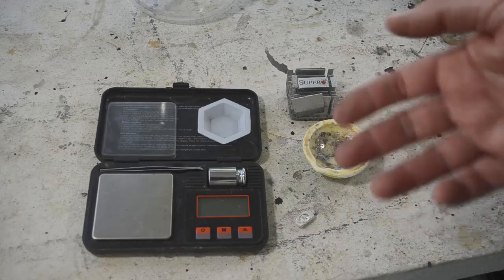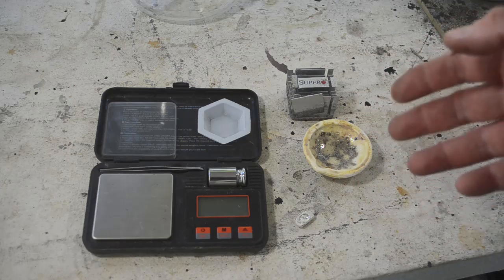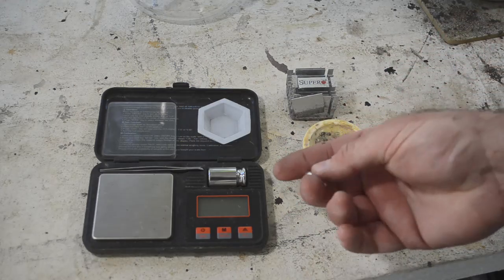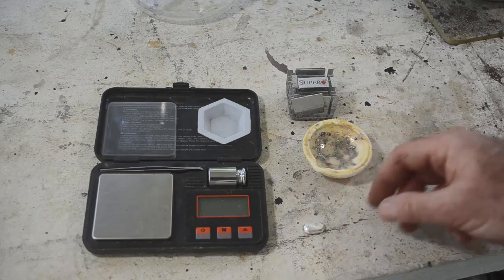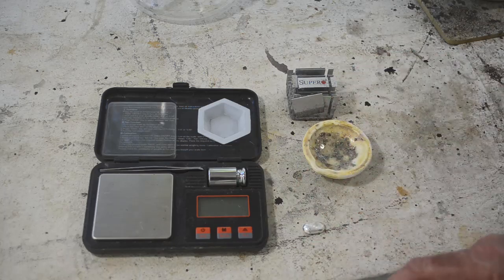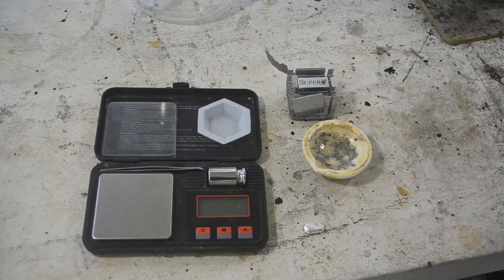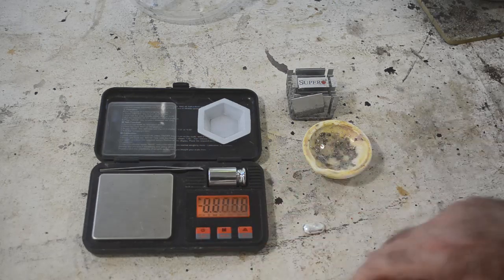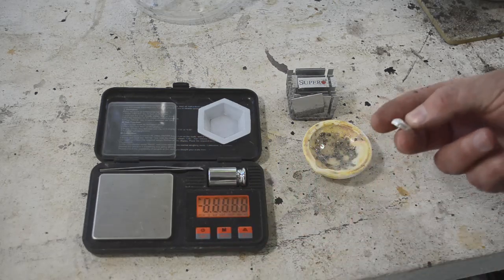So yeah, I was pretty enthusiastic about this experiment the first time I did it. You know, got some clean silver out of it. But the more I do it, and I've done it a few times now, the less enthusiastic I am.